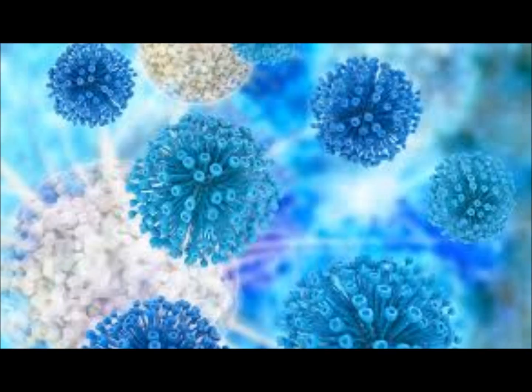Then, Krista, what did you look at next on your 24-hour plates? The MacConkey plate. And what did you need to say? If it was a lactose fermenter or not. But first you had to say G or NG, right? So if it's NG, what does that tell you you're working with? Gram positive. If it's NG, you've eliminated the gram negatives, right? Okay, then if it grows, you do LF or NLF. And the only other thing is a characteristic like mucoid for Kleb and Enterobacter, because that helps the tech. Remember, you may not be followed by yourself, so you've got to make sure someone else can follow you.